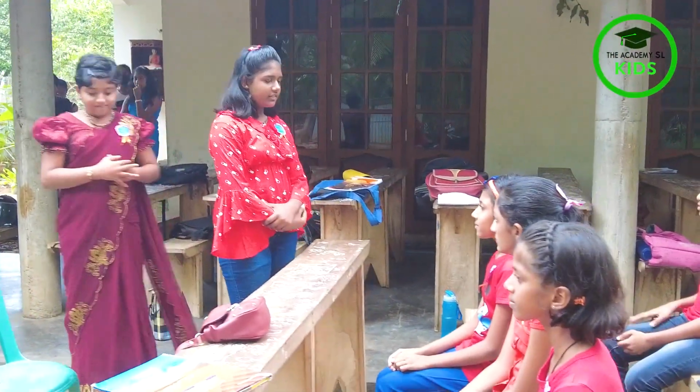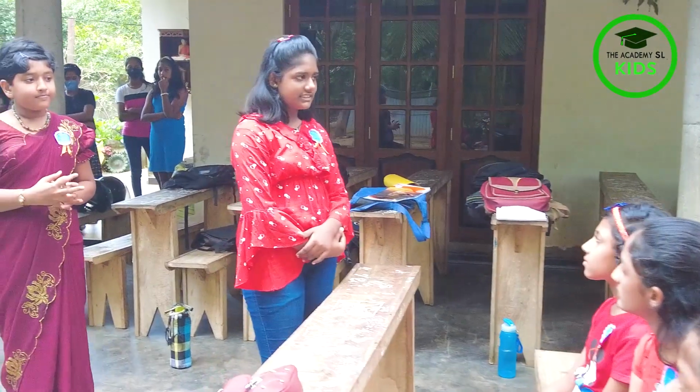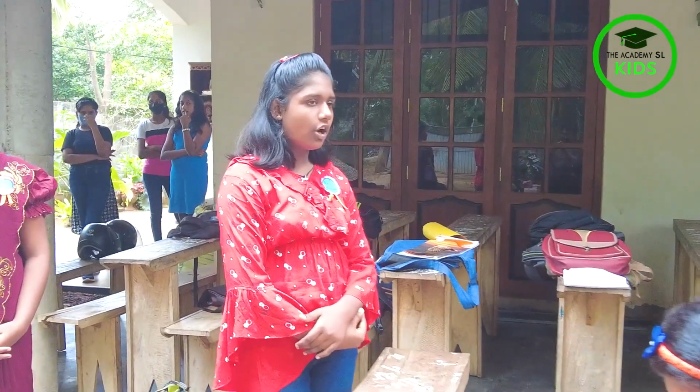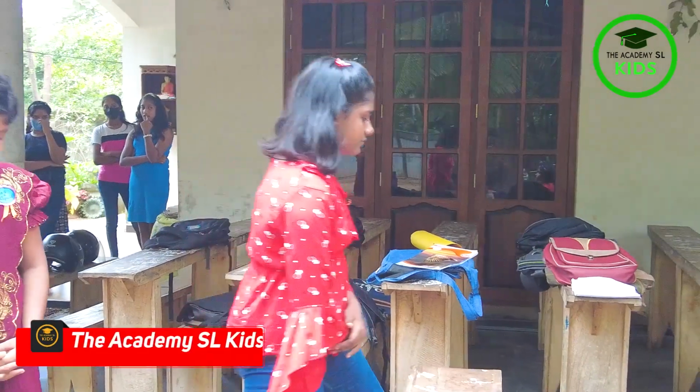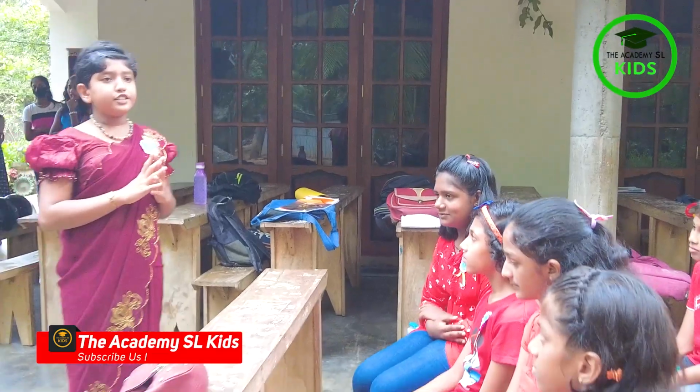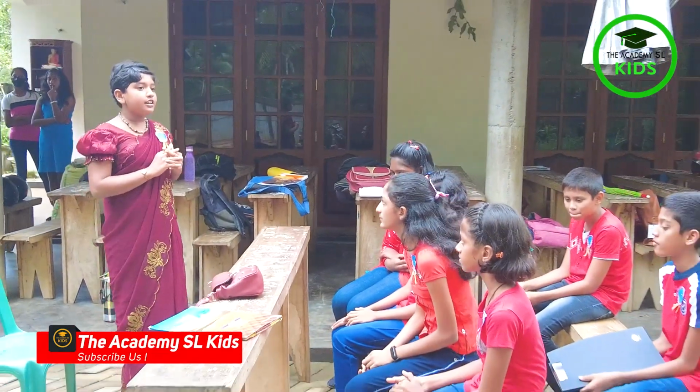When we use this microscope, we have to consider the distance between the lens and the object. When the distance is increased further, the object will become more clear. Very good, Sahan. Please raise your hand whoever knows the meaning of magnification or resolution.